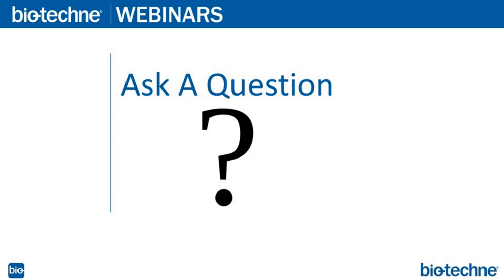Yeah, I mean, we've used it for a number of species. Rats, pigs, ferrets, these types of things we've readily used. We actually have less experience in the mouse. But typically, mouse is more difficult than other systems. We just don't know enough to say whether it works or doesn't work. Yeah, but for the rat and the ferret, it certainly works very well.